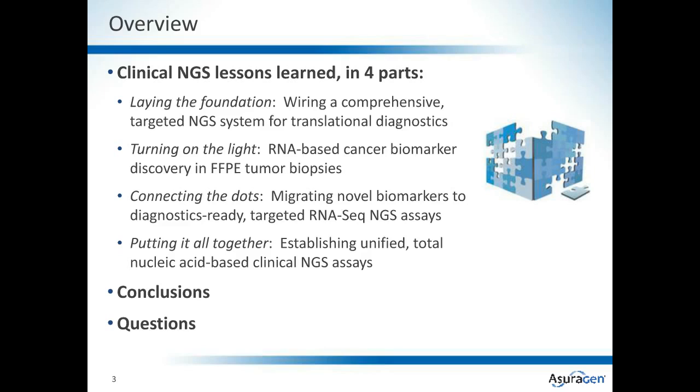Part 2, turning on the light. Biomarker discovery is an intrinsically complex endeavor. It's made more difficult in challenging clinical specimens such as FFPE tumor biopsies. In this part, Brian will describe how we've used whole transcriptome RNAseq methods to identify RNA biomarkers in FFPE.